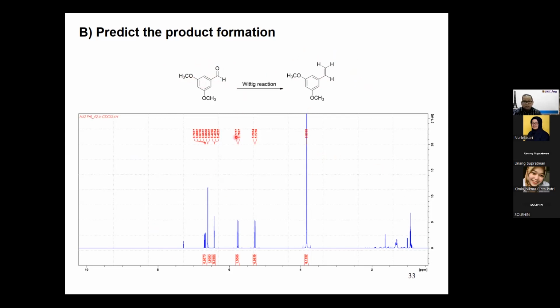What you can observe is that we know this signal is around 9 ppm, around this region, and suddenly it disappears and forms new peaks. Okay, these two geminal signals are represented with these couplings. So it means, okay, I'm finished. I just want to do the work-up, go for it. Okay, this is the solvent that we use during the reactions.